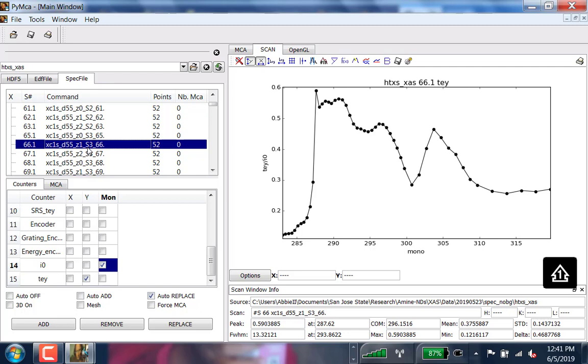So everybody should print up the shared SSRL run that we used on May 23rd, and then you can get an idea of what the sample names actually mean. So S366, if we go back to our key, S3 is ND-OX500C acid base.